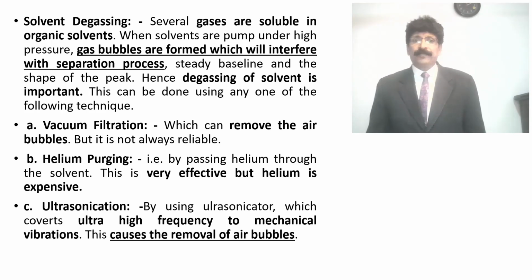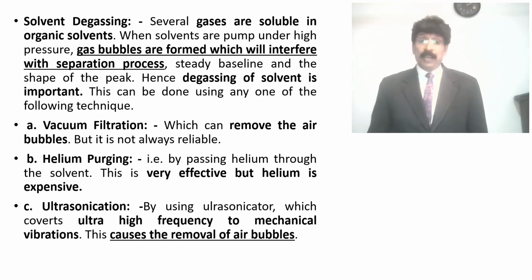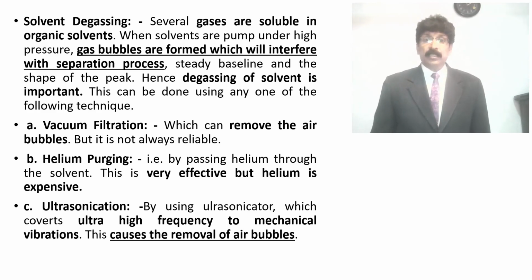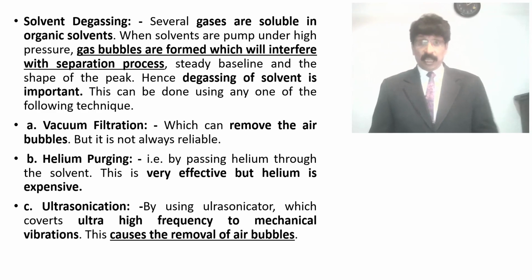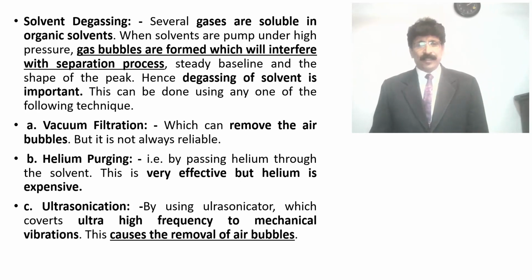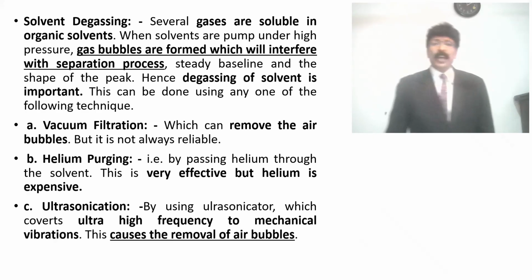Ultrasonication is the new technique we are using nowadays. The ultrasonicator converts ultra high frequency to mechanical vibration. This causes the removal of air bubbles.